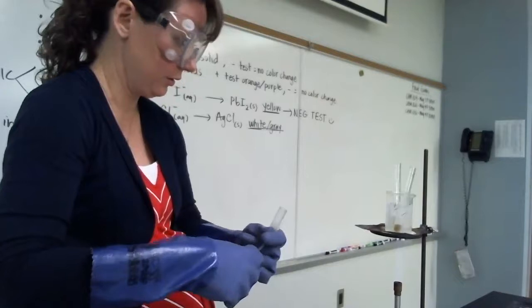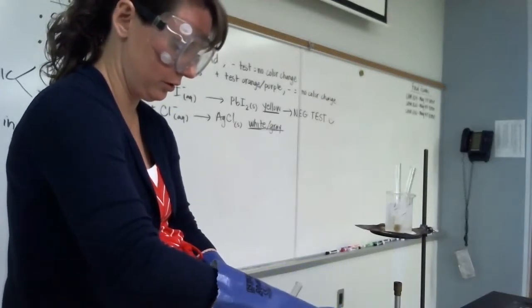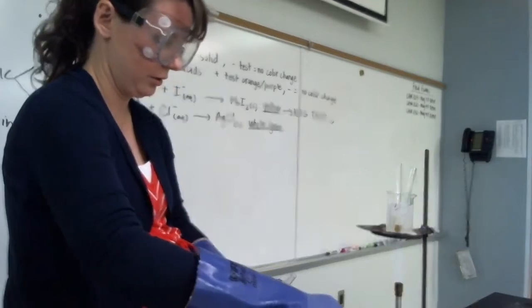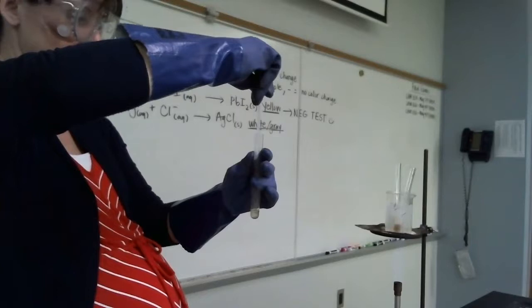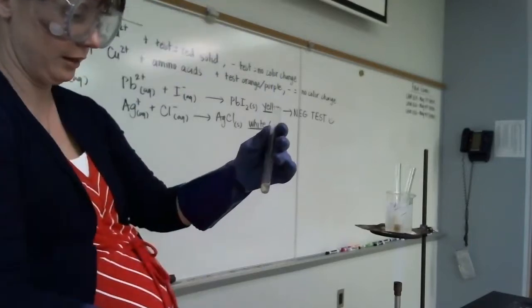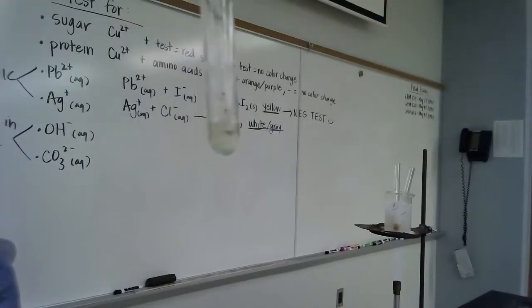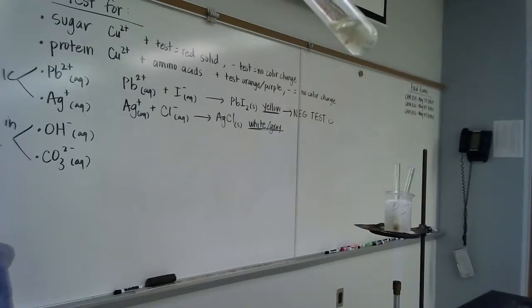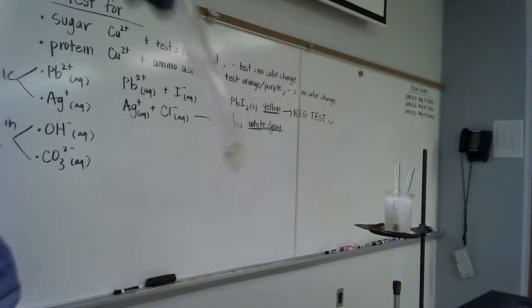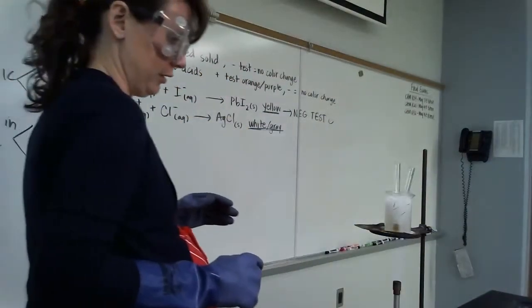It looks pretty similar. Clear colorless. Equal volume added. Whew, we can breathe a sigh of relief here as well. Right, there's no precipitate at all. No precipitate. That's a negative test. That's good news. That's very good news.